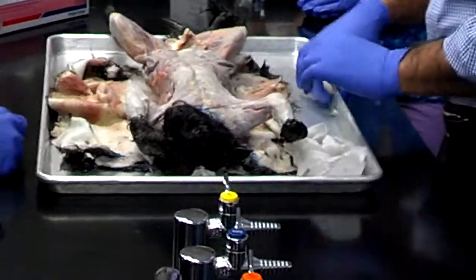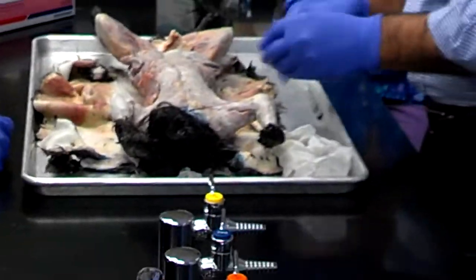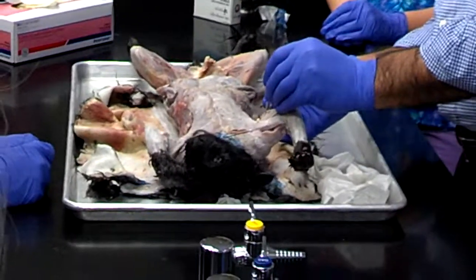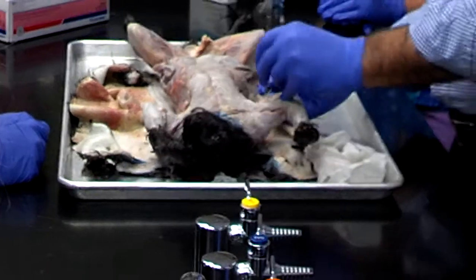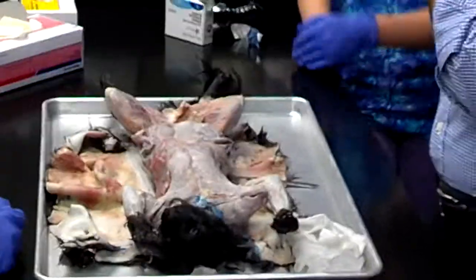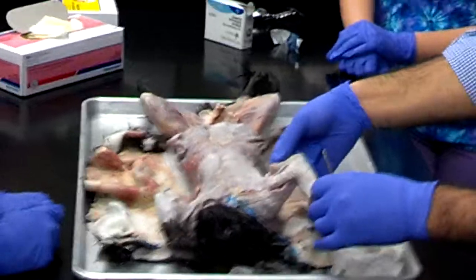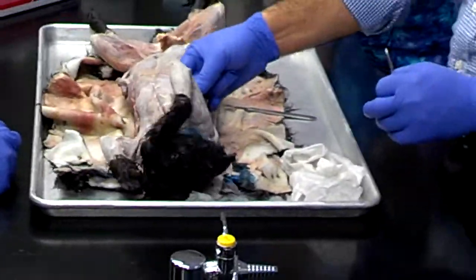This muscle, very thin muscle here, which is covering the medial aspect of this, is your epitrochlearis. Very thin muscle which is covering the, you see this one? Which is covering the medial side of your arm right here. Got it? This thin muscle. Below this is your triceps, right? This is your triceps.